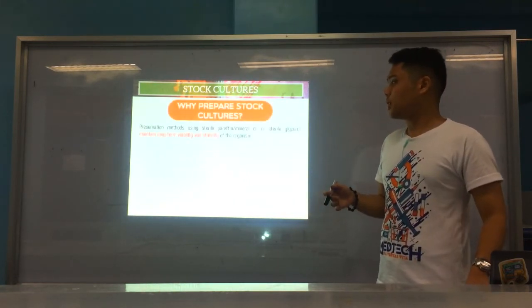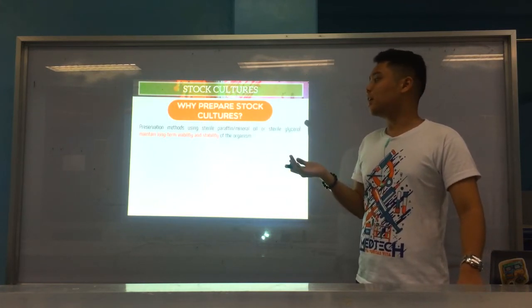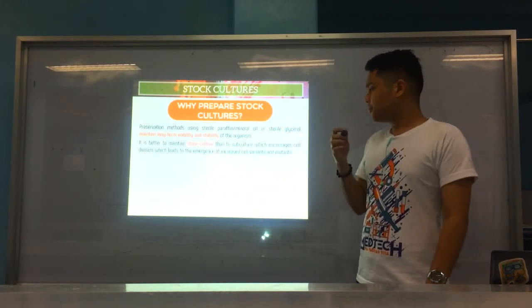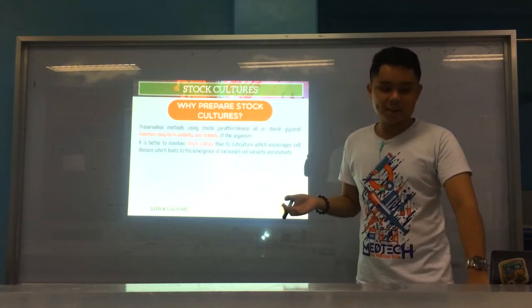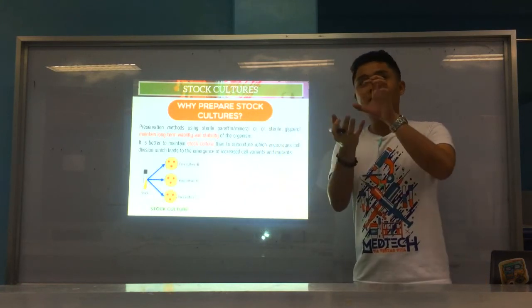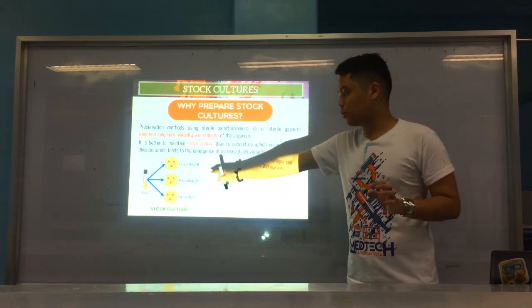And why do we prepare for stock cultures? Because again, we want to make sure your stock cultures preserve viability and stability of the organism. Because your stock culture, it's your original culture, right? And kaysa subculturing, this is a demonstration. So your stock culture will serve as the primary culture, and then dito na kamukuha from your different pure cultures.